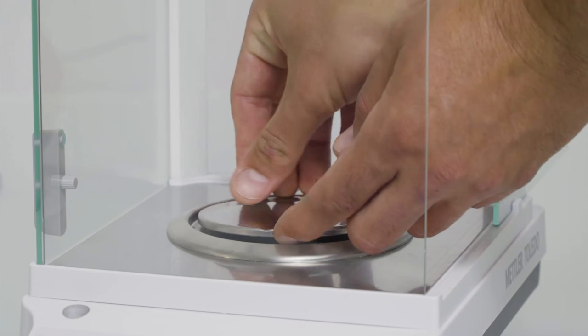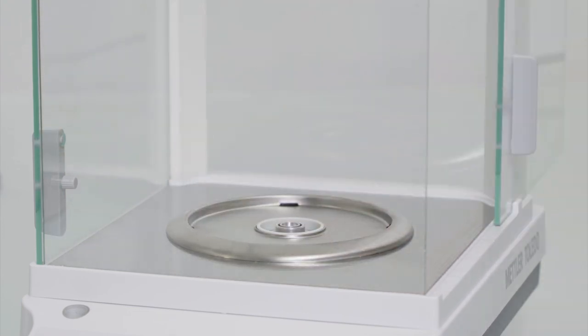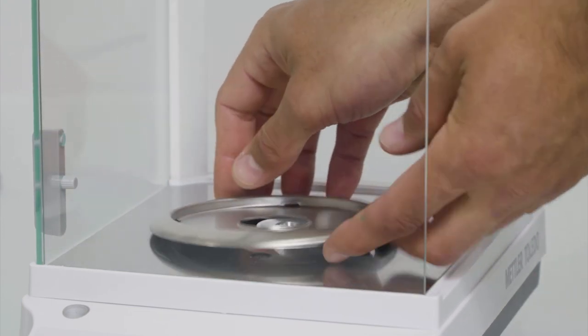MET balances are designed to make cleaning easy. They have smooth and flat surfaces and are made of durable and chemical resistant materials.